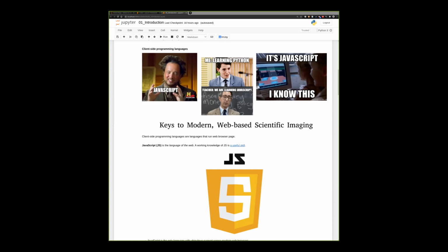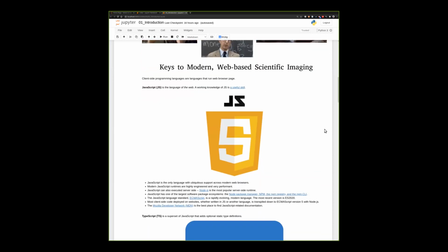So that's wonderful. So hopefully you'll get a lot out of this tutorial, and I think you're all very smart people, and JavaScript is one of the easier scripting languages to pick up and learn. So it's definitely within your capabilities, I'm sure. And I think Andres has some experience, but this tutorial is right for you if you have experience in R, Python, or MATLAB. You are well on your way.